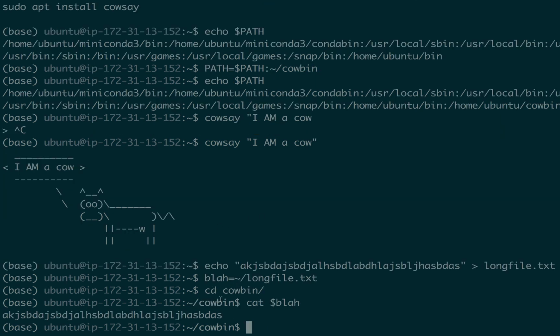Now, why is this helpful? Well, if you start to get a bunch of really long sequence names, like you start getting these SRR, bunch of numbers _1.fastq, well, you could set one of those, plus the path if you wanted, equal to read1, right?